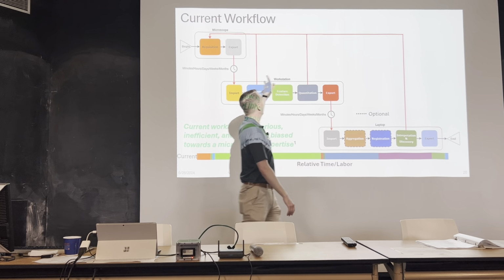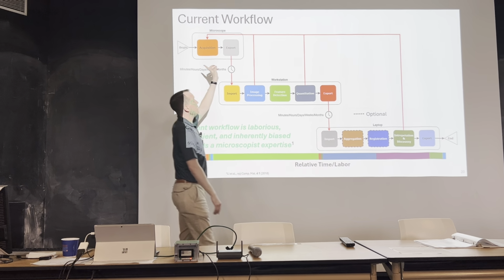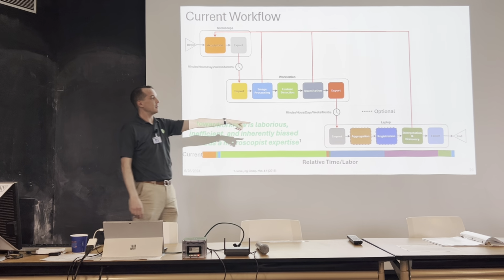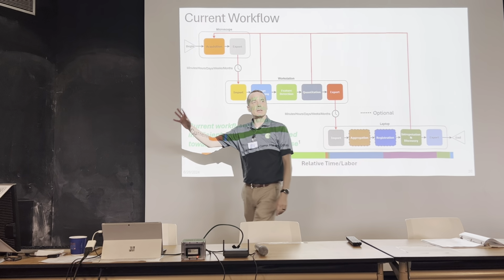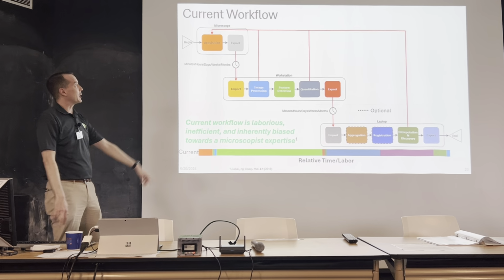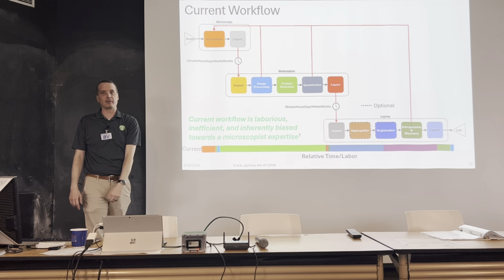But there's also, along the way, you have this negative feedback loop. And we have one occasion where we're talking with one lab and one person, 2 years afterwards, they're down in this phase here, and they found out they collected the entirely wrong data. They were looking at the wrong area while they were on the microscope. And so they had to go back, and it took them then another 2 years to go through this whole process all over again.